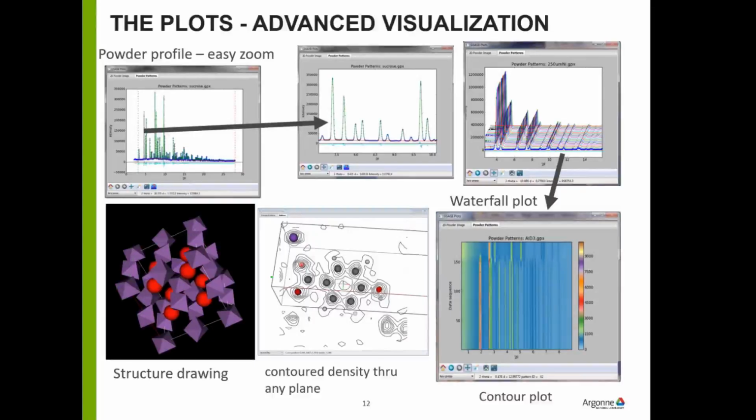And this is then a slice of the Fourier map, which is in the plane of that structure, centered on that point, which is the viewpoint thing that you're actually looking straight at. You can move that around. You can rotate the structure. And the contour stuff all follows with it.